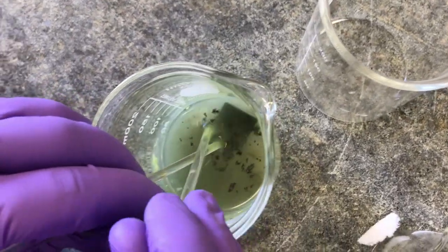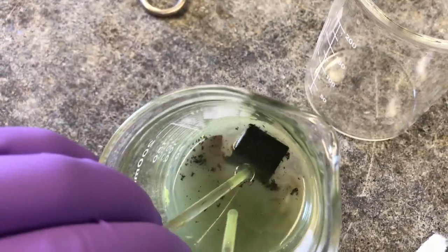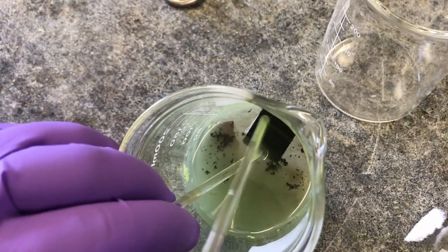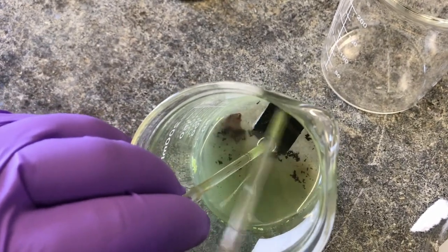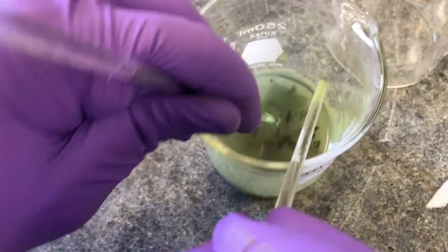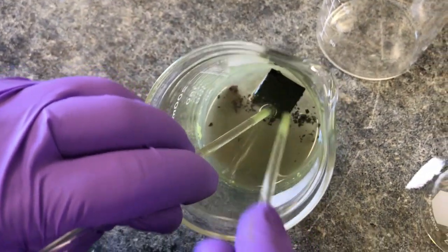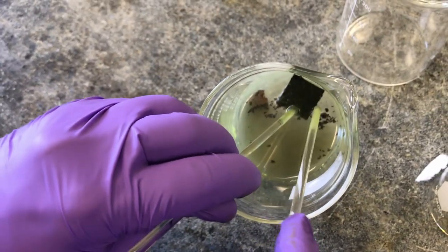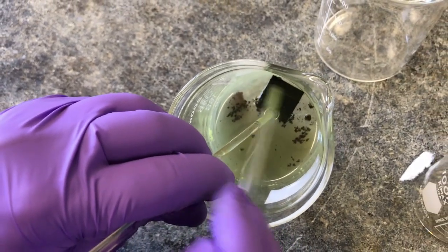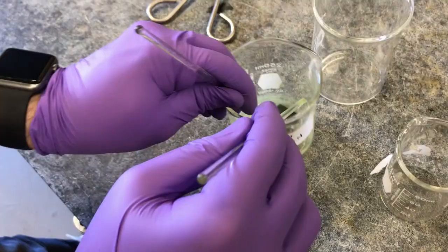So right now we're going to see how to check if the solution has gone to completion. On this zinc piece, very black, we're going to scrape and see that there are scratches showing the clean zinc surface. Do you see that? Yeah. So you see the scratches. Now we're going to carefully let the copper chloride solution wash over it, and we're going to tilt it back, and you see that the scratches are gone. That means that the copper chloride is still reacting with the zinc surface, forming this dark copper surface on top of the zinc. So I'm going to keep scratching, and check back in a minute.